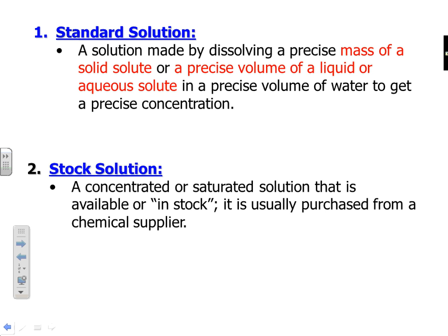The next thing that we have to measure is the volume of the liquid, because we're going to be diluting that or dissolving it in a solution. What did I do with my beaker? I could measure volume using a beaker. But a beaker, you'll notice, has a big wide mouth.